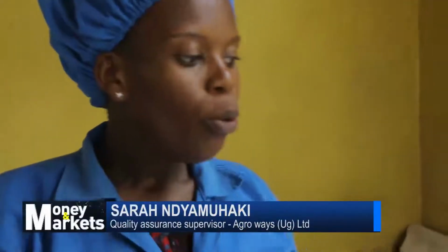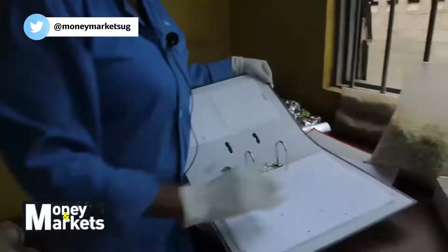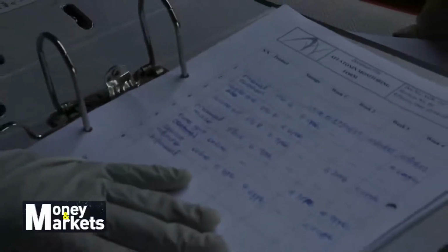After we had tested the maize from our sample, which was for Benjamin, then we record the results. Of course, the name of the person, the results. For example, now we have got 2.9 ppb. That's 2.9 parts per billion, which is within the acceptable limits, which is below the standard of 10 ppb. So this is good maize. We accept it. And after we accept it, we keep records. This is where we keep our records. For example, we write all the samples we have taken, and these are the records we base on while making decisions.